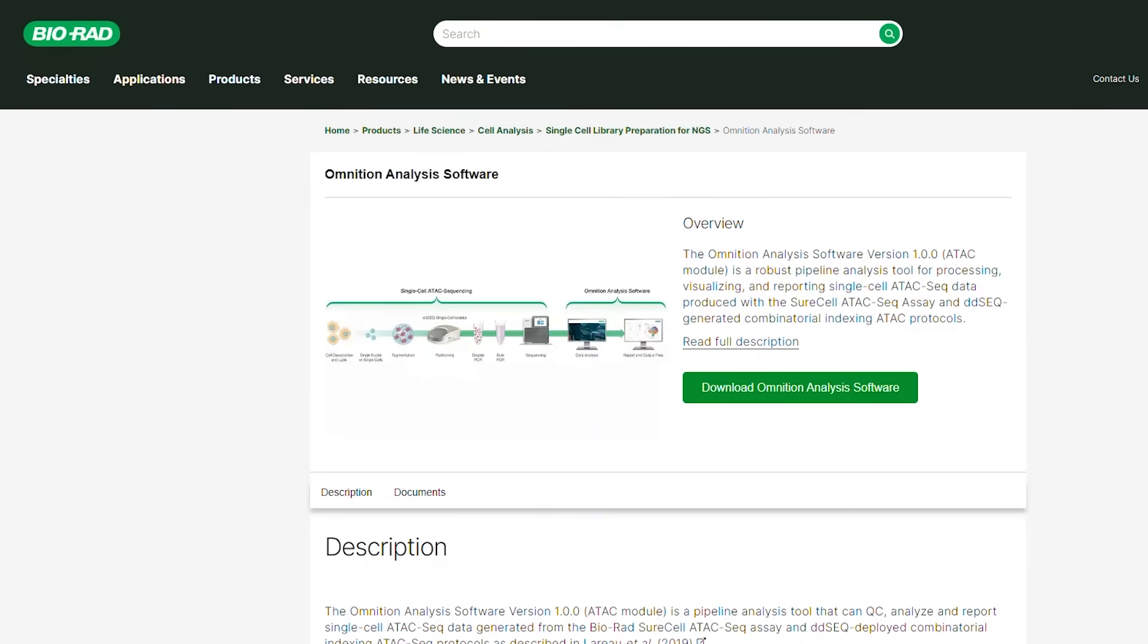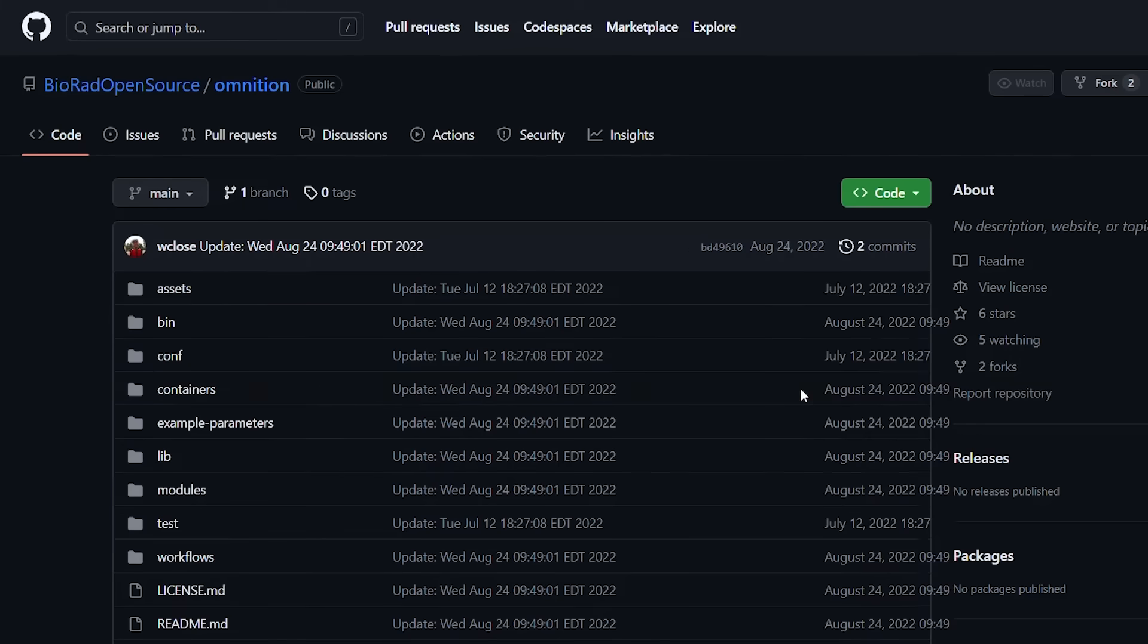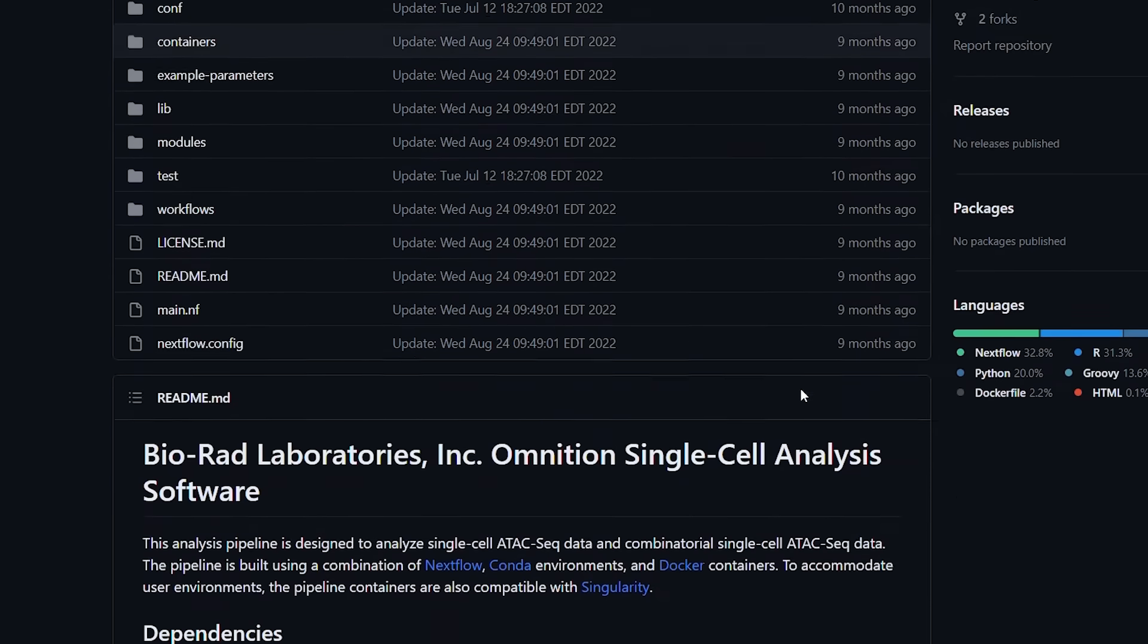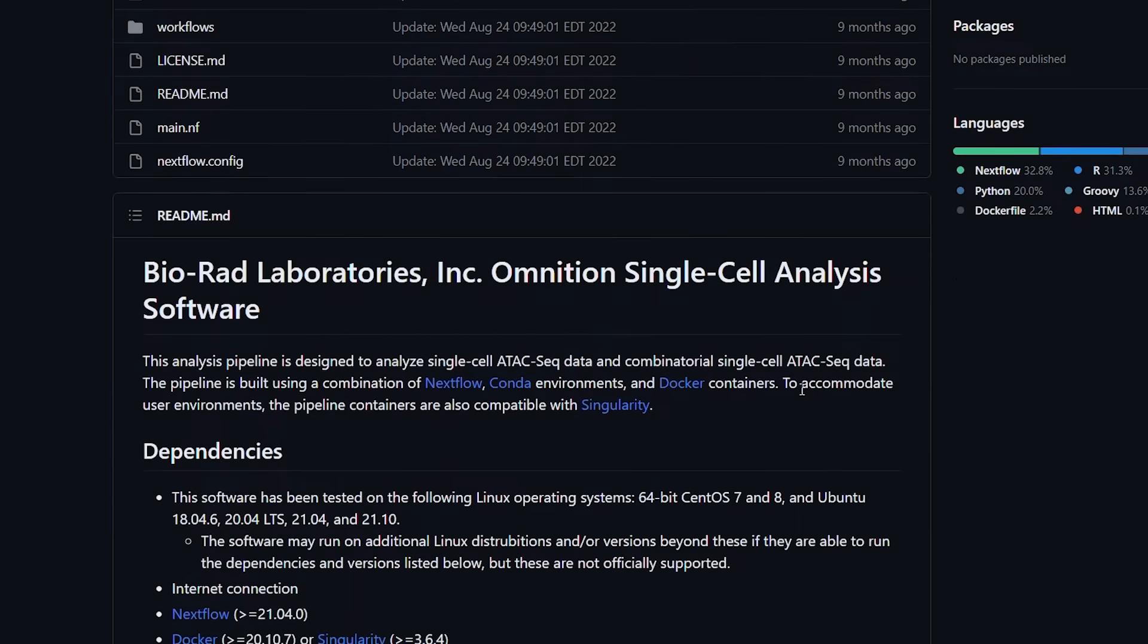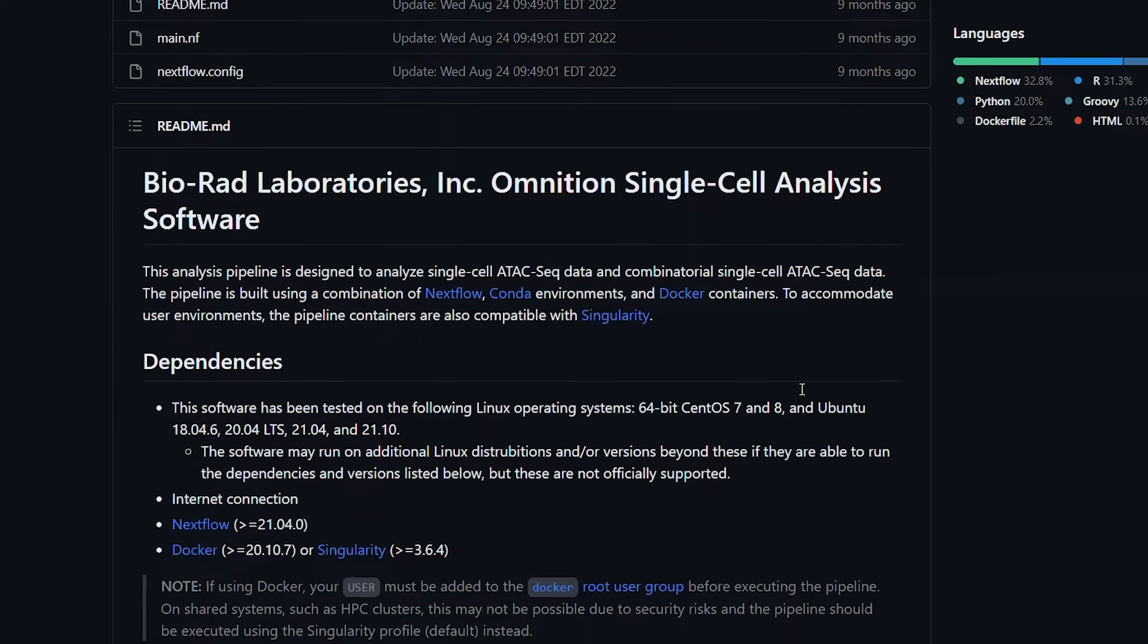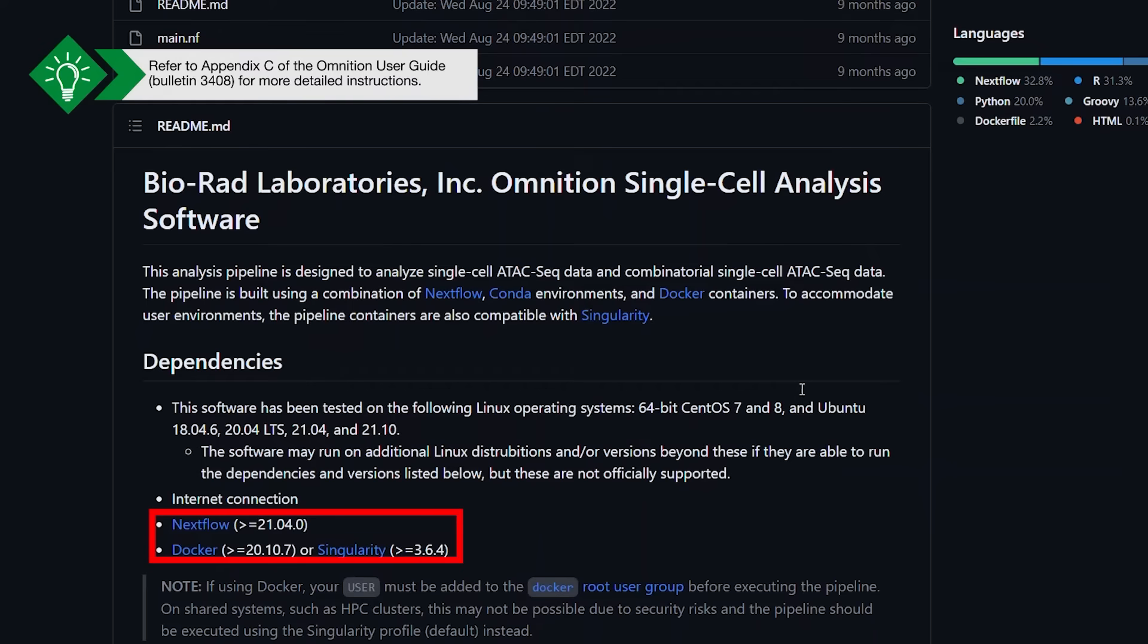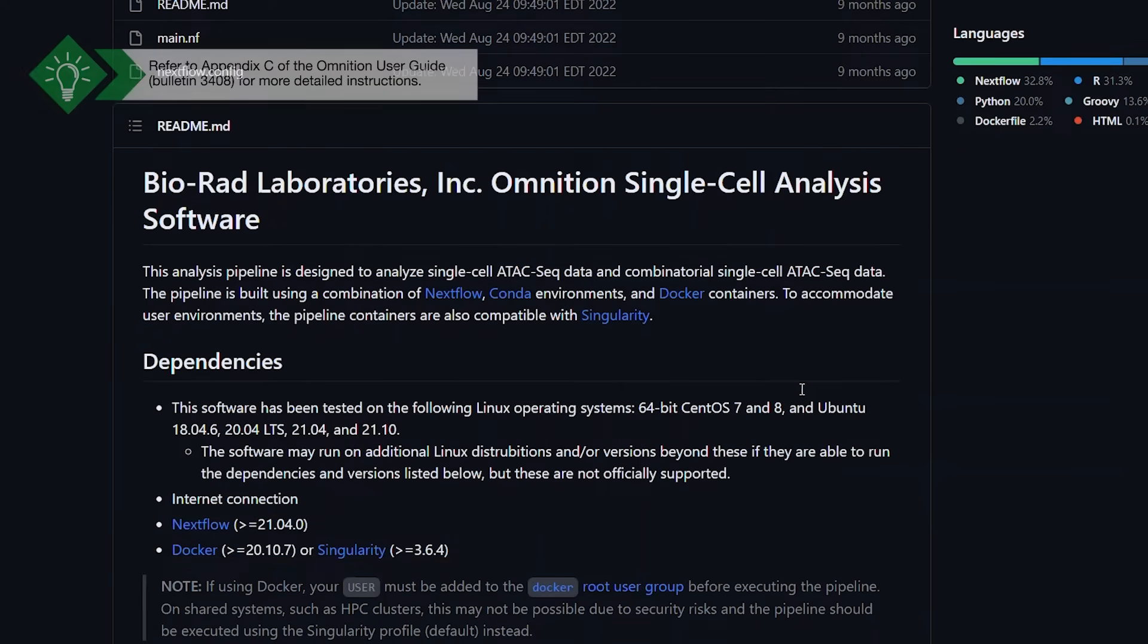Users can download Omnition Analysis software as a standalone copy by going to the Bio-Rad website and clicking the Download button, which will direct you to the Omnition repository on GitHub. Additionally, if users have the Omnition dependency components such as Nextflow and Docker or Singularity, users can run Omnition from the Linux-Unix command line without downloading a standalone copy.